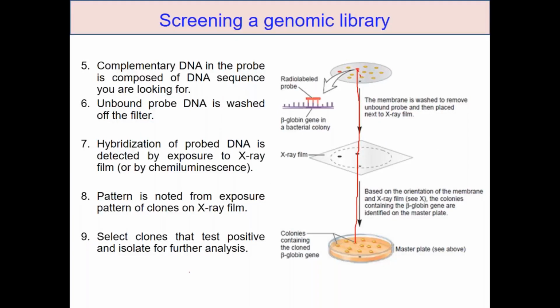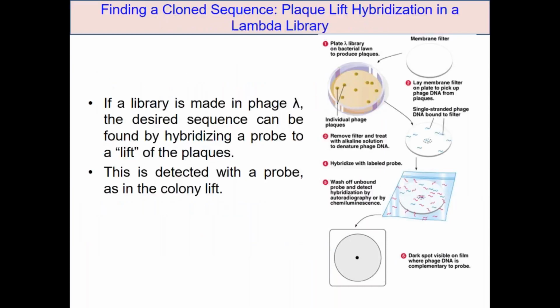The next one we are going to discuss is plaque hybridization. So plaque means what? Do you guys remember what is meant by plaque? What is called plaque formation? In bacteriophage lysis, we call that area plaque formation. Very good. Bacteriophage lysis zone.